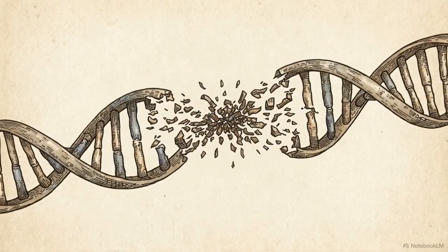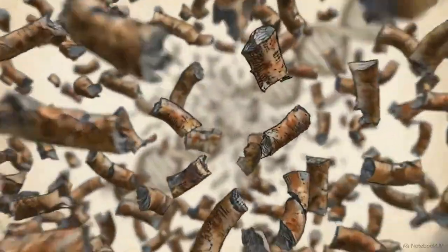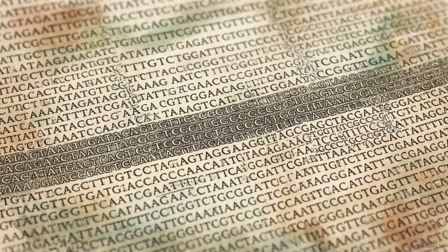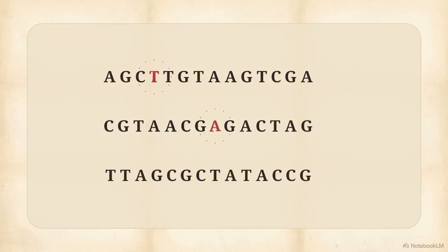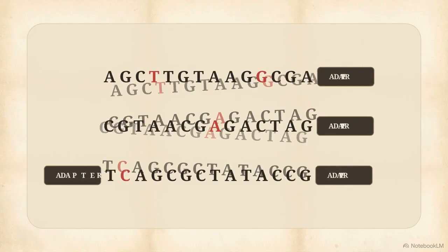To process the DNA, they must shatter it into millions of tiny pieces, usually around 150 base pairs long, called reads. The immediate result is a massive, highly chaotic data file. Alongside actual genetic information, this file is crowded with machine errors, chemical typos, duplicated fragments, and artificial adapters from library preparation. The clinical risk hidden in this noise is significant.